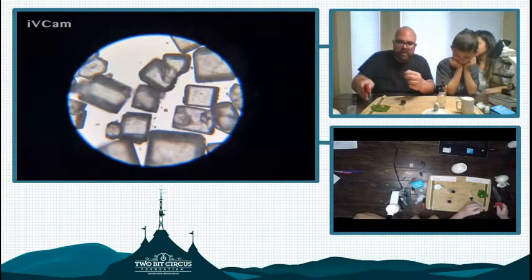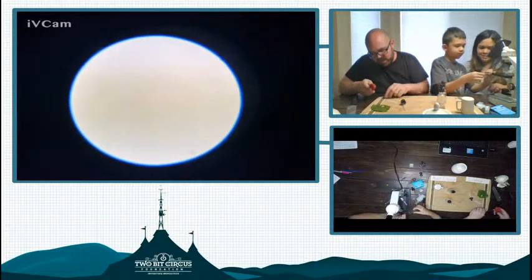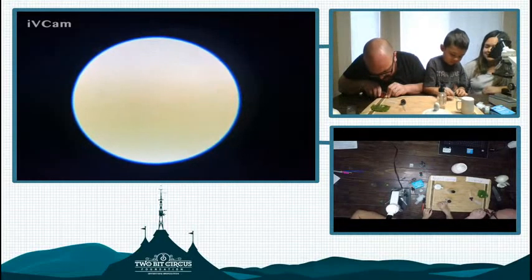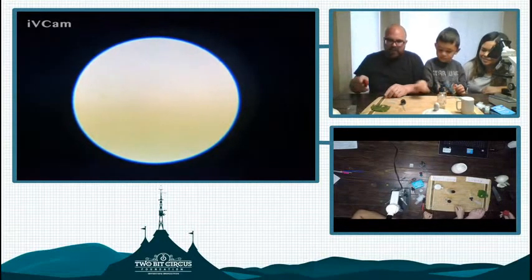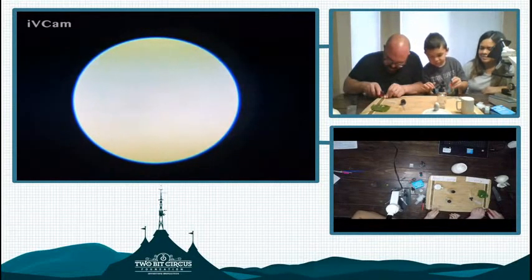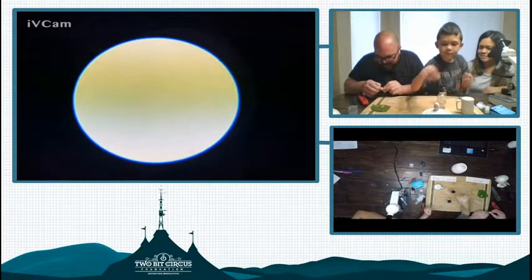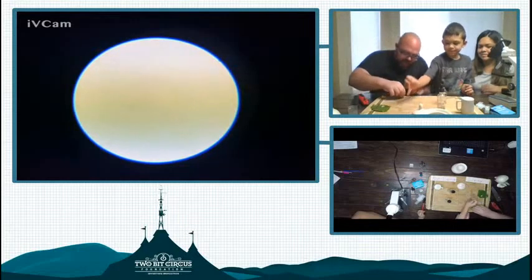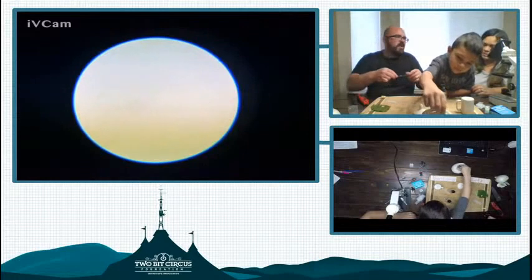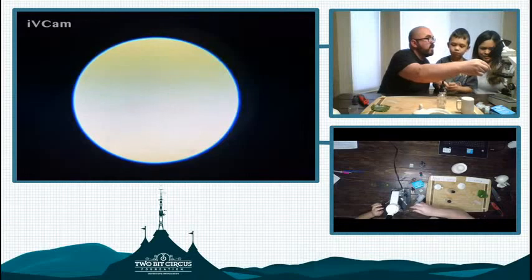That cork. So what I'm trying to do again, because cork is not transparent, it won't work very well with this microscope unless you get a really thin slice. So I'm trying to get a really thin slice here that the light will be able to see through. And I was also trying to get the piece to be relatively flat. Now I wonder if this piece is still going to be too thick or not. But let's see, Robert. What do you think? This one's going to be interesting, Robert.